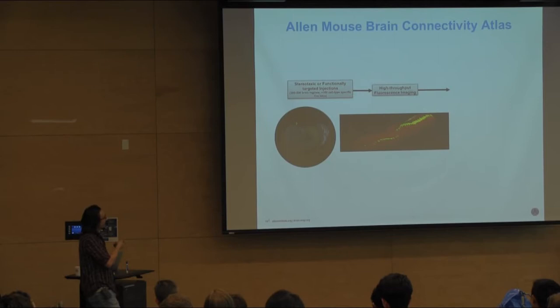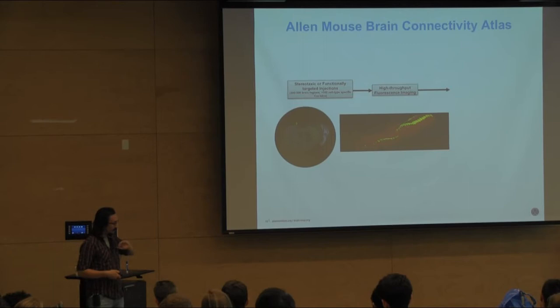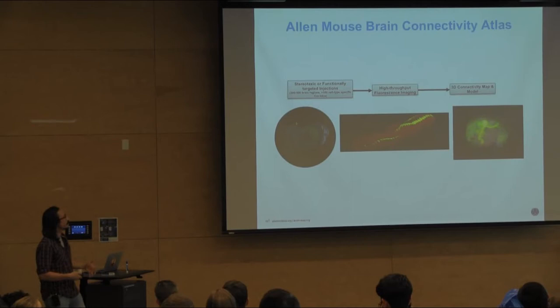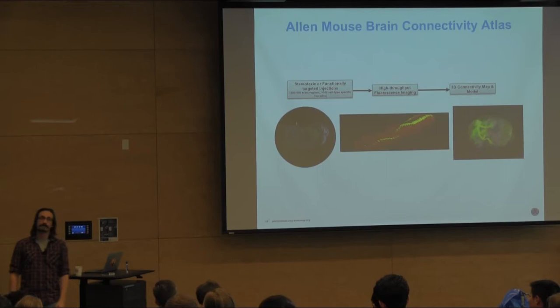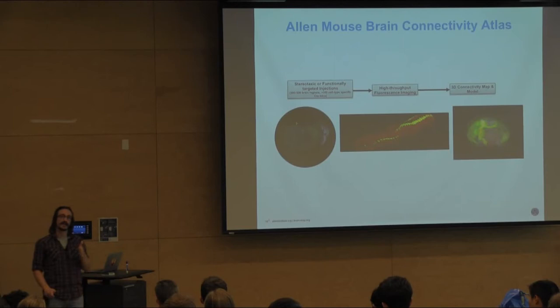And then the brain is serially sectioned and scanned with a two-photon microscope. Serial two-photon tomography, so that you can see in sections the progression of the axons as they move between the different brain regions. And then a reconstruction is applied afterwards in order to collect that data back together and actually mark the projection patterns. And then that data is co-registered into a coordinate system we call the common coordinate system. Yeah, the sectioning happens at a physical section of 100 microns. The vibratome typically causes a bit of damage to the top several microns. So the actual imaging happens, I think, at something like 20 microns or 15 microns. It's in the methods. That's below the damage profile of the vibratome.